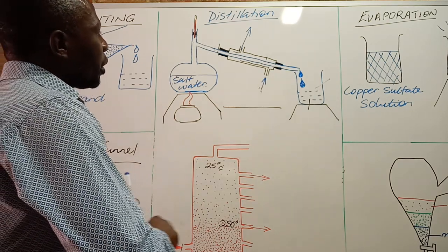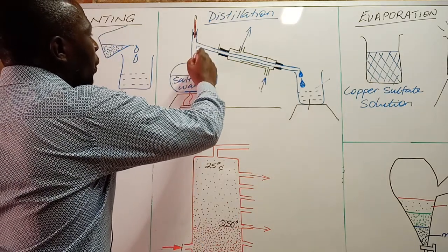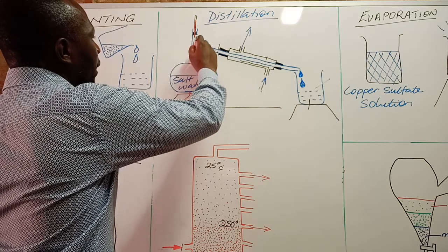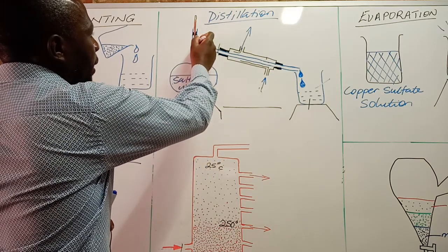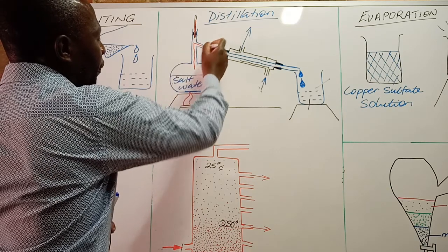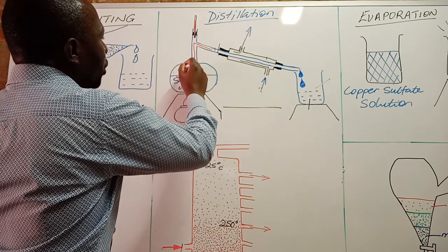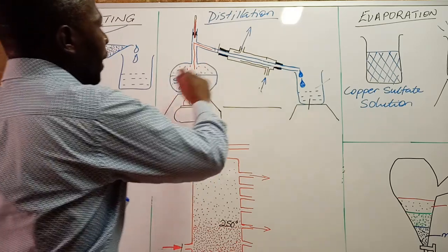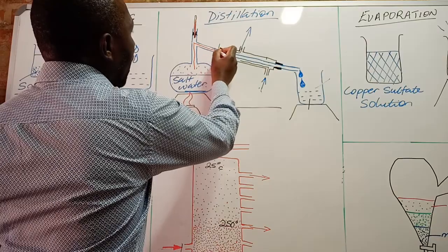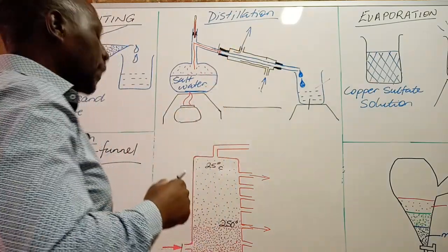And when this solution reaches a boiling point, water is going to leave, and this is the easy route out. So when water starts to boil and it leaves in form of steam, it will be a gas. Up to this point, water will be in form of gas.